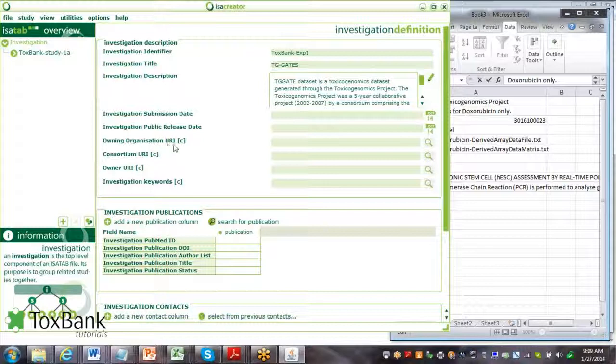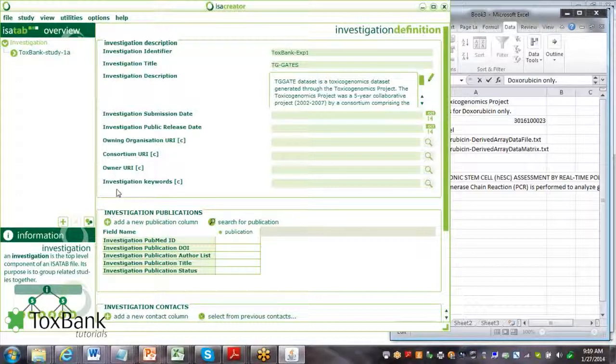There's a number of things which are important to fill in. These four: owning organization, consortia, some URI, owner, and investigation keyword. I'll just review these quickly.